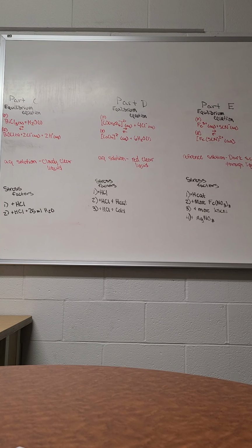So, for example, in part C, my observations for the first stress factor was the aqueous solution plus HCl. And then my observations for stress factor 2 was the aqueous solution plus HCl plus 25 milliliters of H2O.